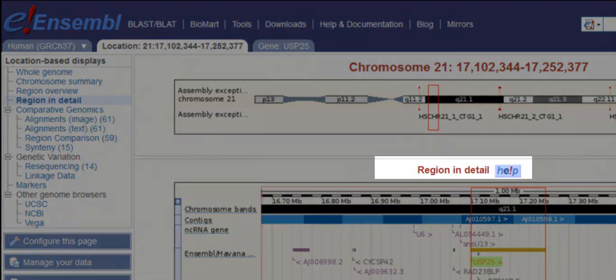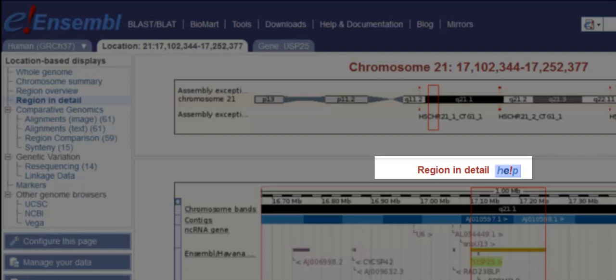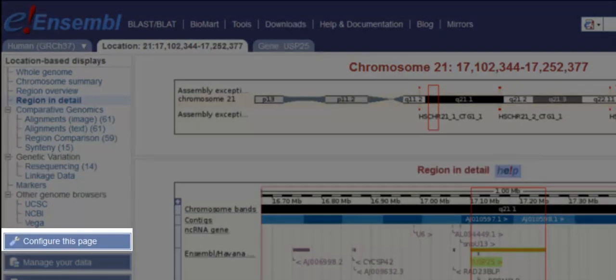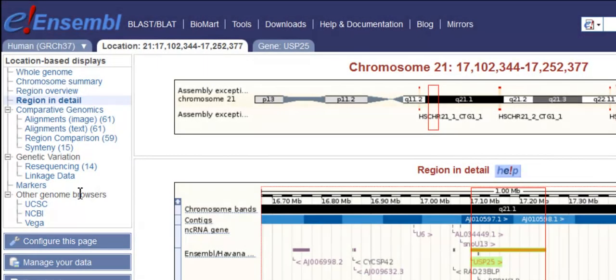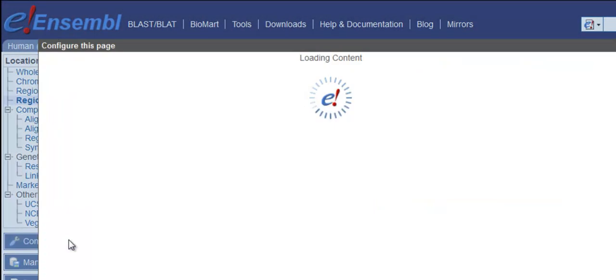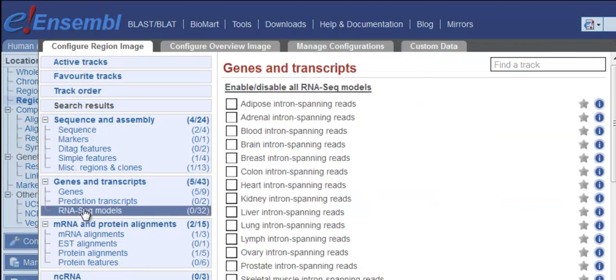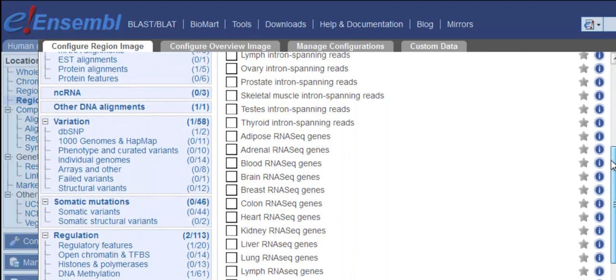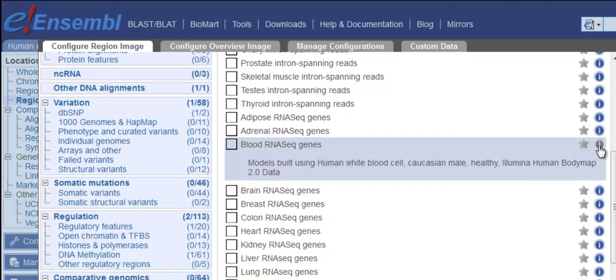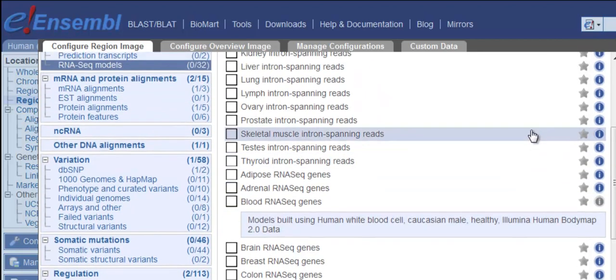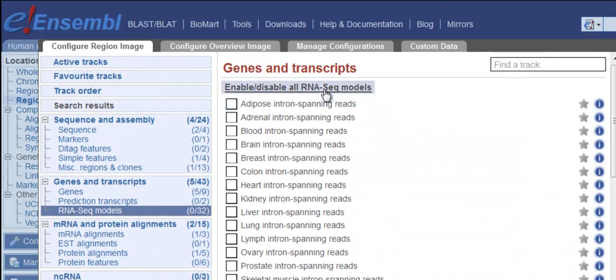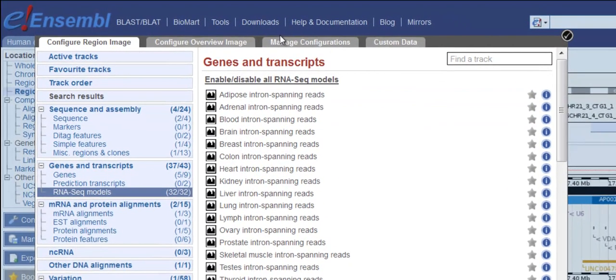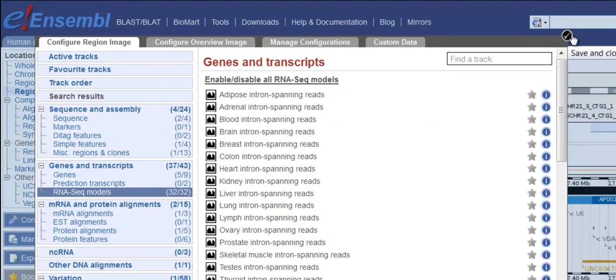This is region in detail. To add the RNA-Seq tracks, I'll click Configure this page at the left and then RNA-Seq models. The list of introns and gene models are shown for different tissue types. Click on the eye icon to find out where the RNA-Seq data comes from. Let's turn them all on. I'll enable all the RNA-Seq models. Now we'll close the menu by clicking on this tick or anywhere outside the box.